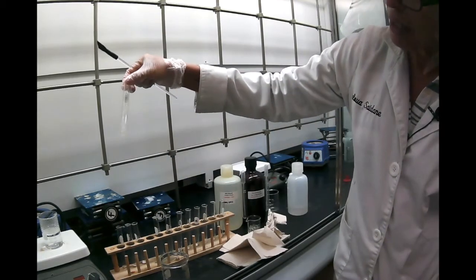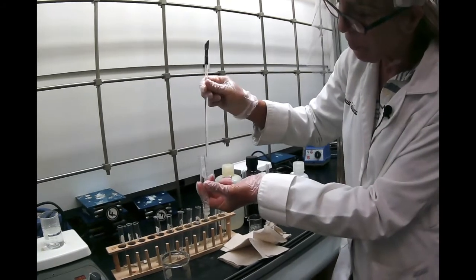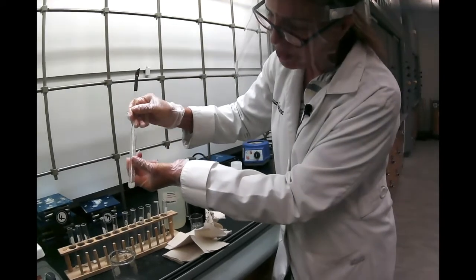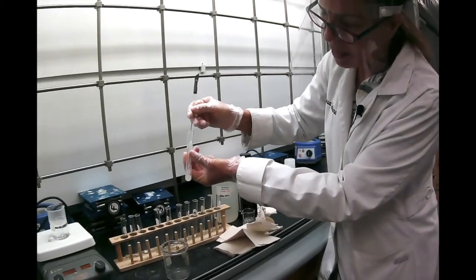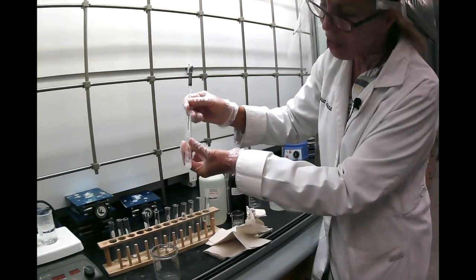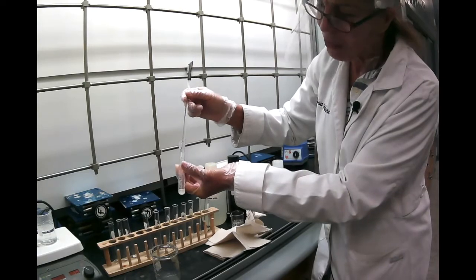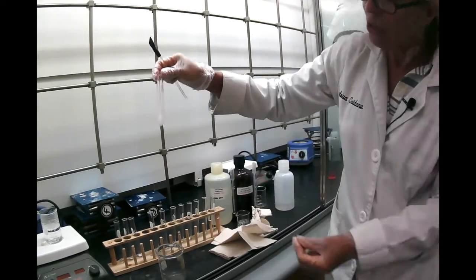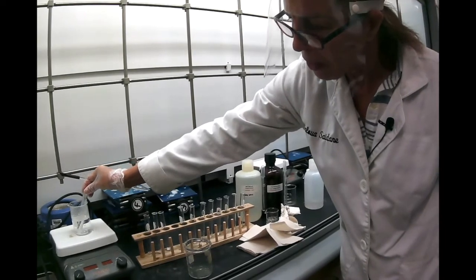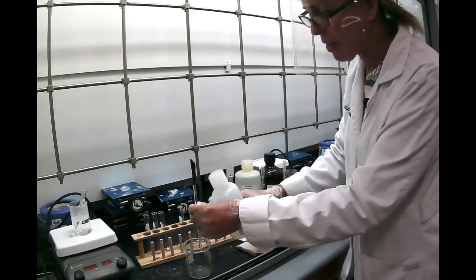I already see that naphthalene is not soluble, but I'm going to try to dissolve it. If you look at the structure of naphthalene, it's a completely non-polar substance, so it's obvious that it will be hard for naphthalene to dissolve in water. So what you do, if it doesn't dissolve, put it in hot water and wait and see if it dissolves eventually.